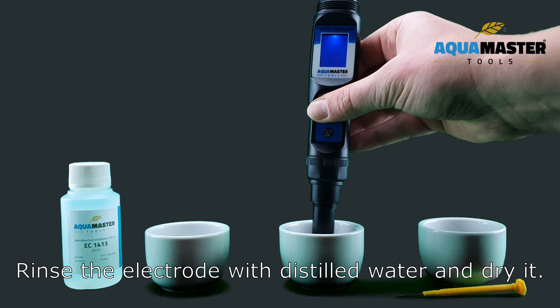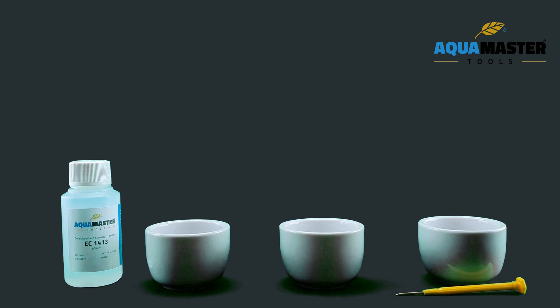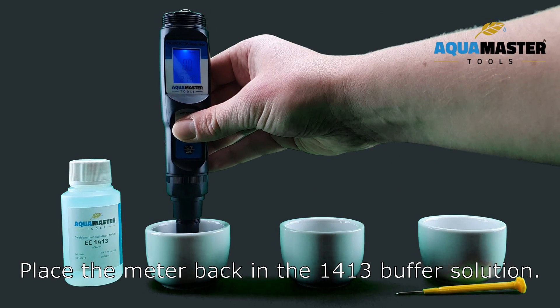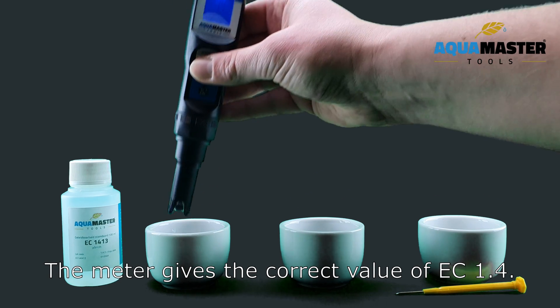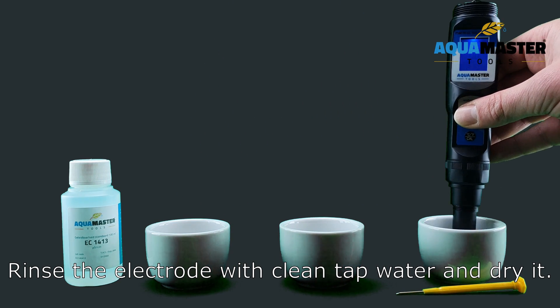Rinse the electrode with distilled water and dry it. Place the meter back in the EC1413 buffer solution. The meter gives the correct value of EC 1.4. Rinse the electrode with clean tap water and dry it.